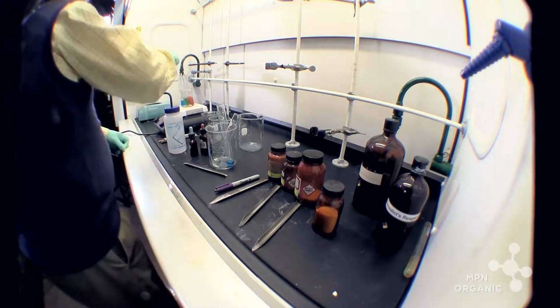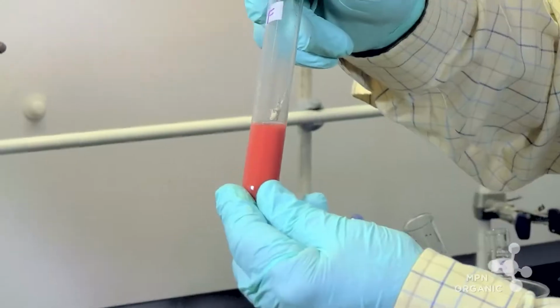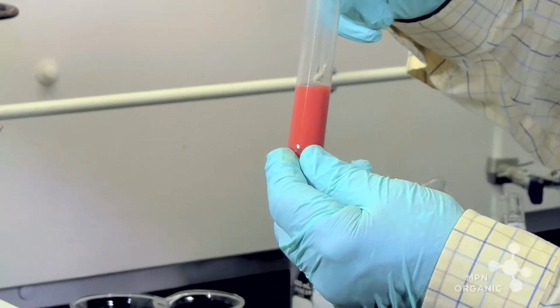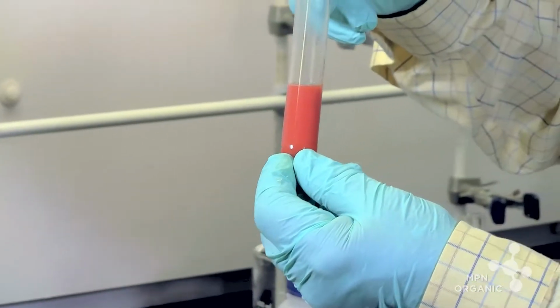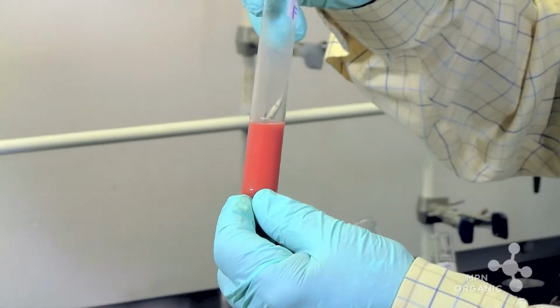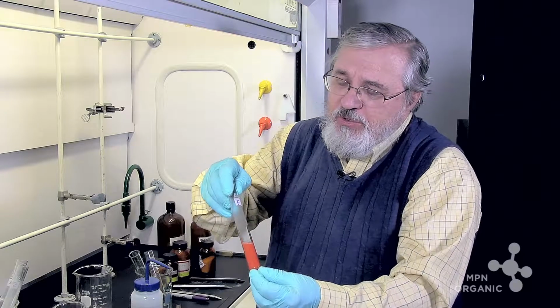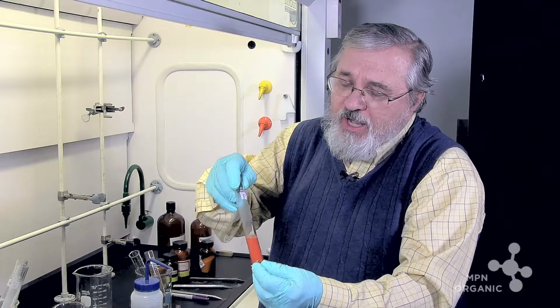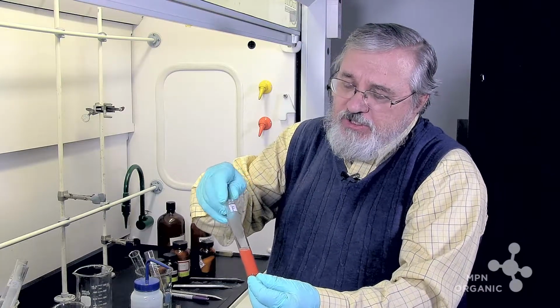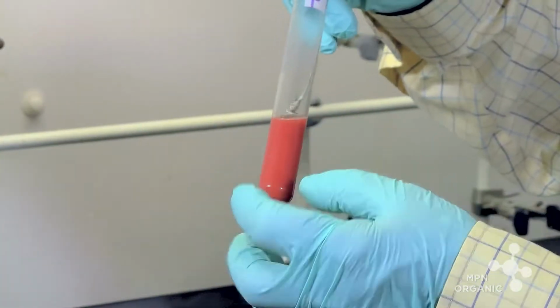So there we go. Notice, by the way, the fructose is almost completely orangey red. That's the copper 1 oxide precipitate that's formed. So we say that copper 2 ion has been reduced to copper 1 ion, and this change is very evident from the blue to orange color.